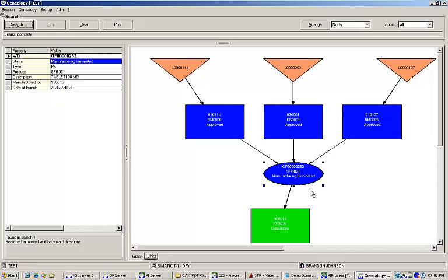Instantly, I'm able to see the three lots that we used in this work order represented as triangles in the chart. The blue rectangles represent the specific containers used from those lots and show their status at the time. The work order status is shown in the oval and the green rectangle shows that we produced a new lot that is currently in quarantine status waiting to be released.